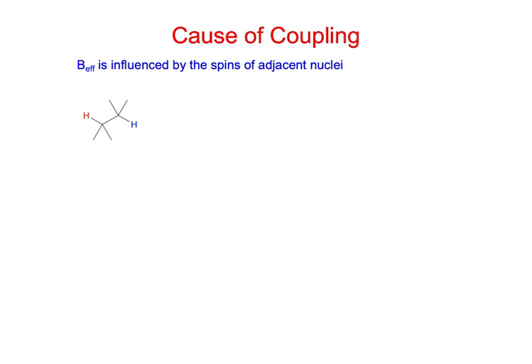Okay, so we're going to look at 2 different protons, and we're going to see how one proton is affected by the other proton. Let's start out by drawing. This is going to be our applied magnetic field, B0. Let's say we're going to observe this proton that's in red. The blue proton is on the adjacent carbon, so this would be in a vicinal situation, a 3-bond.